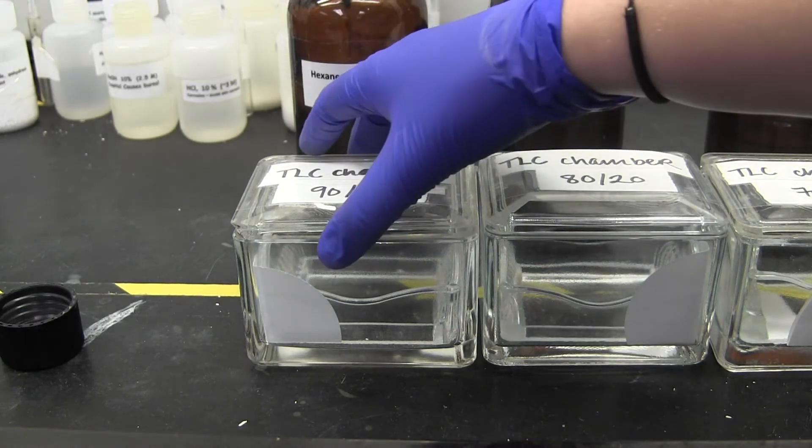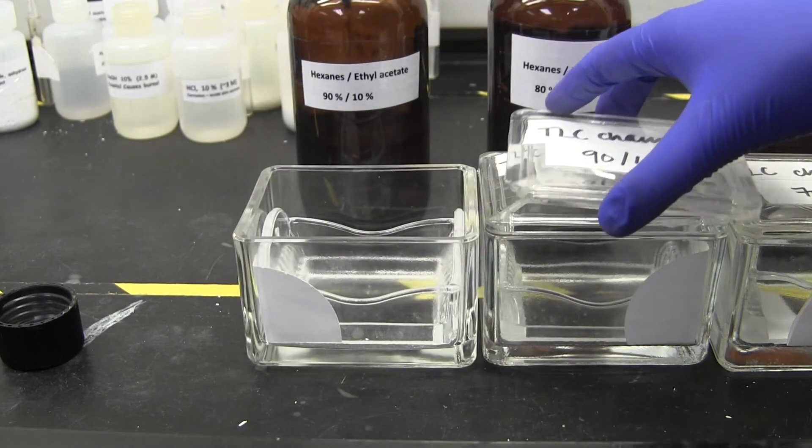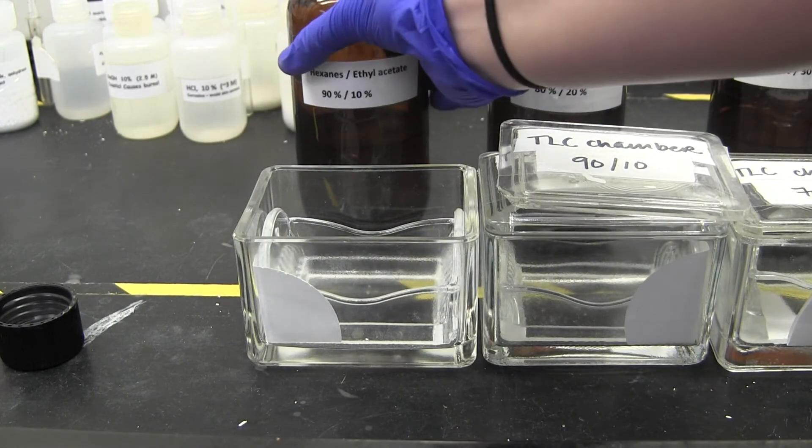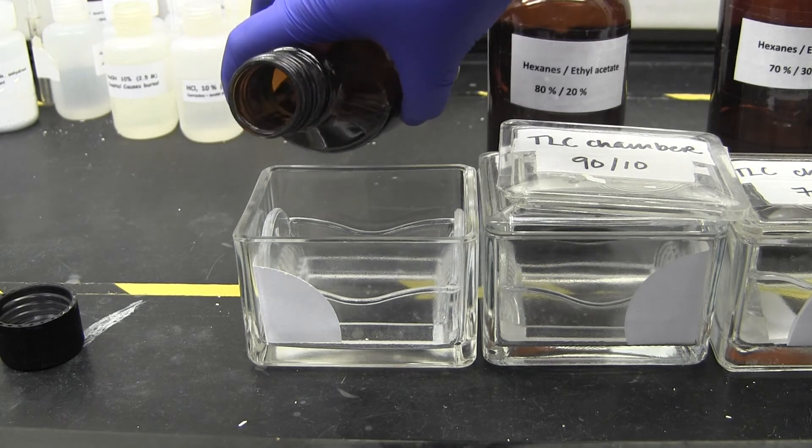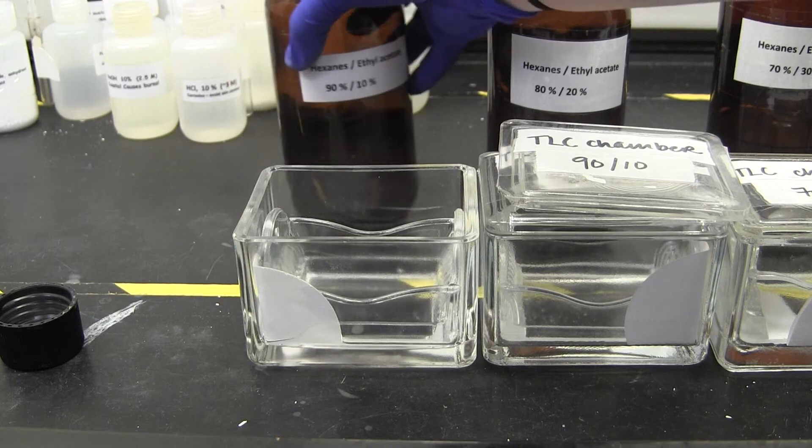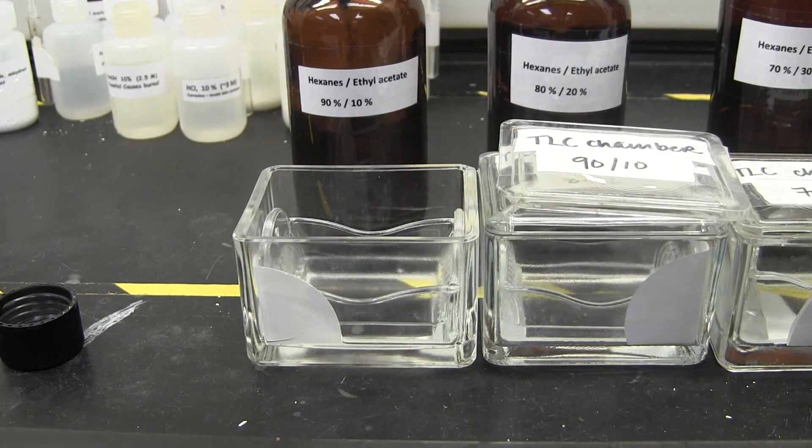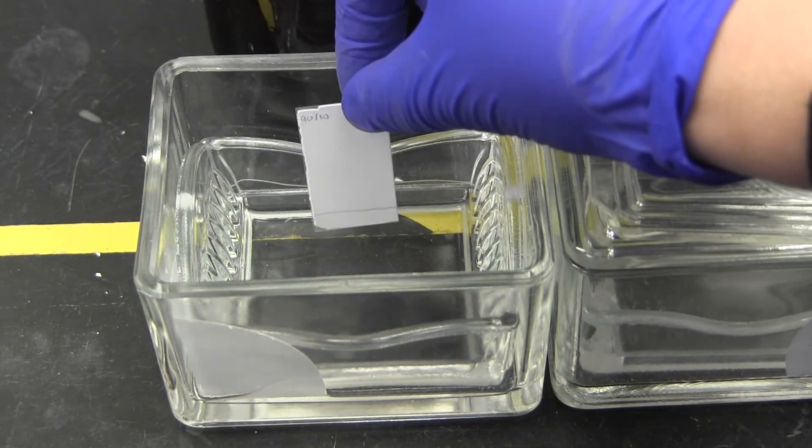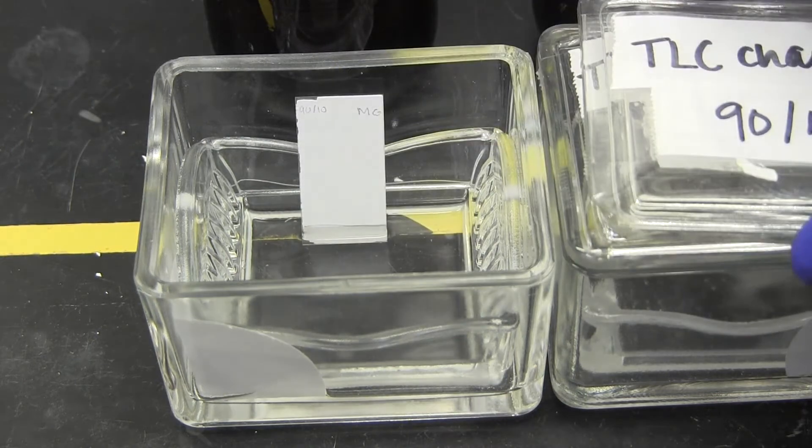Use the TLC chambers to test your solvent mixtures, and try to form a group to run several plates at once. The chambers are glass boxes, and use only the solvent that is labeled on the top. The solvents evaporate very quickly, so move fast and lean your TLC plate against the inside wall of the chamber, and replace the lid immediately.